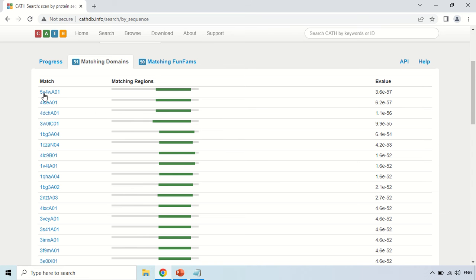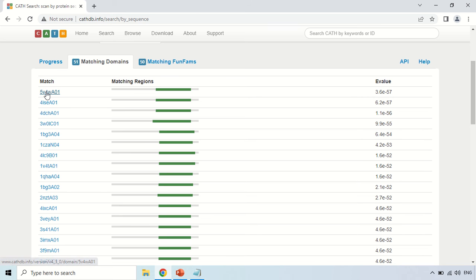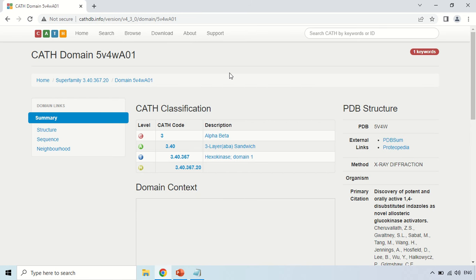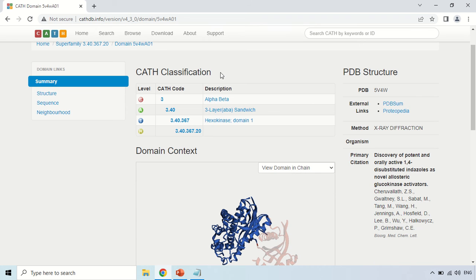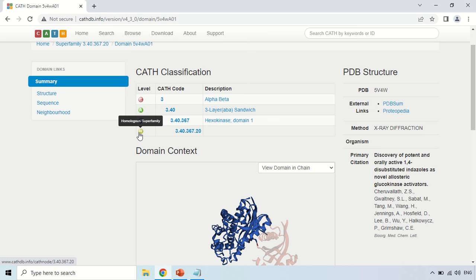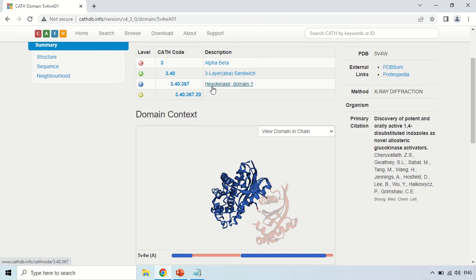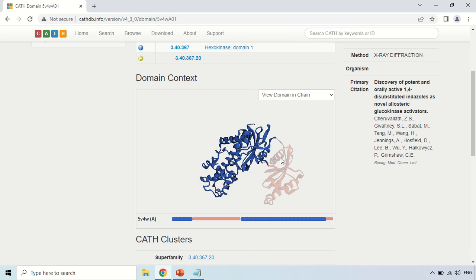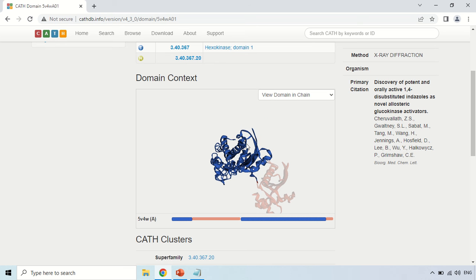Here are the IDs of the proteins to which your protein has been structurally matched, along with the matched region. To view one, you can open it in a new tab or click directly. This shows the CATH classification: the class of this matched protein is alpha-beta. These are the architecture, topology, and homology. The first match is a hexokinase domain — this is the domain structure shown in blue, with a 3D view that you can rotate.